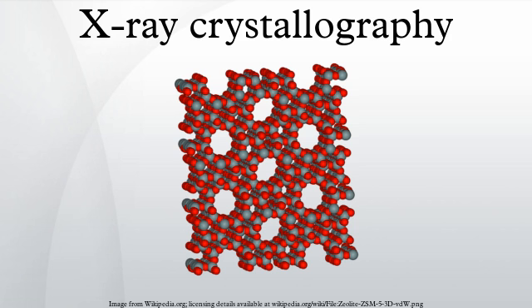X-rays are generally filtered to a single wavelength and collimated to a single direction before they are allowed to strike the crystal. The filtering not only simplifies the data analysis, but also removes radiation that degrades the crystal without contributing useful information. Collimation is done either with a collimator or with a clever arrangement of gently curved mirrors. Mirror systems are preferred for small crystals or with large unit cells.